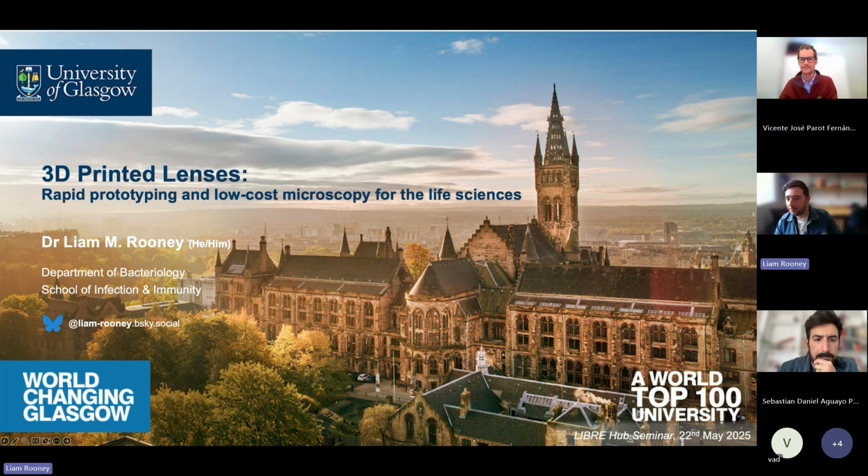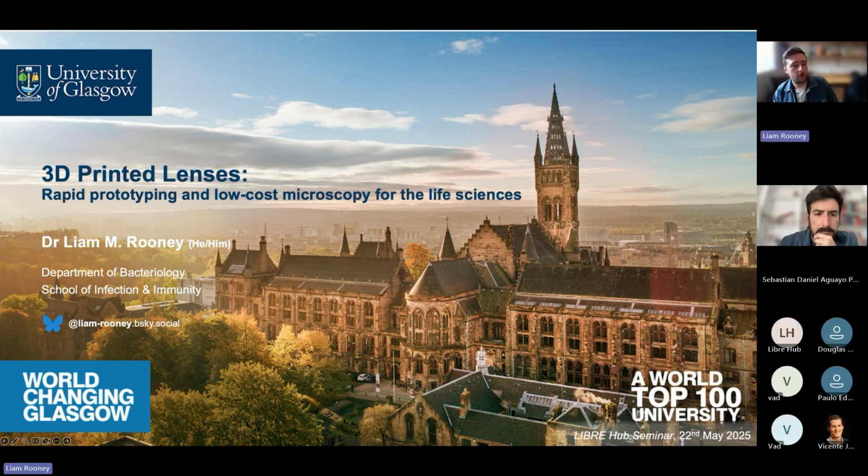Awesome, thank you. By training, I'm a microbiologist, but you'll be glad to hear that I'm not speaking about microbiology today. Instead, I'm going to take you through some recent work that we've been doing on 3D printed lenses. The entire initiative was really focused on creating open additive manufacturing methods for microscopy to try and lower the cost for high precision, high quality lenses that are often the limiting factor when developing microscopes in low resource settings.